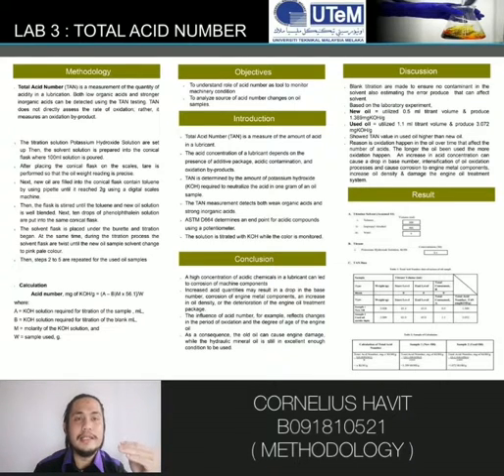After we find the total, we must divide with the sample used. So we will get the total acid number.